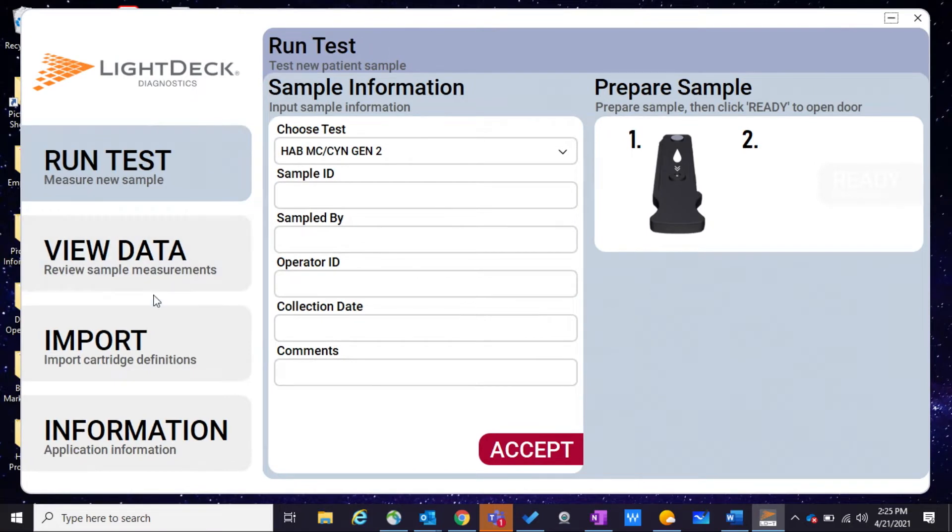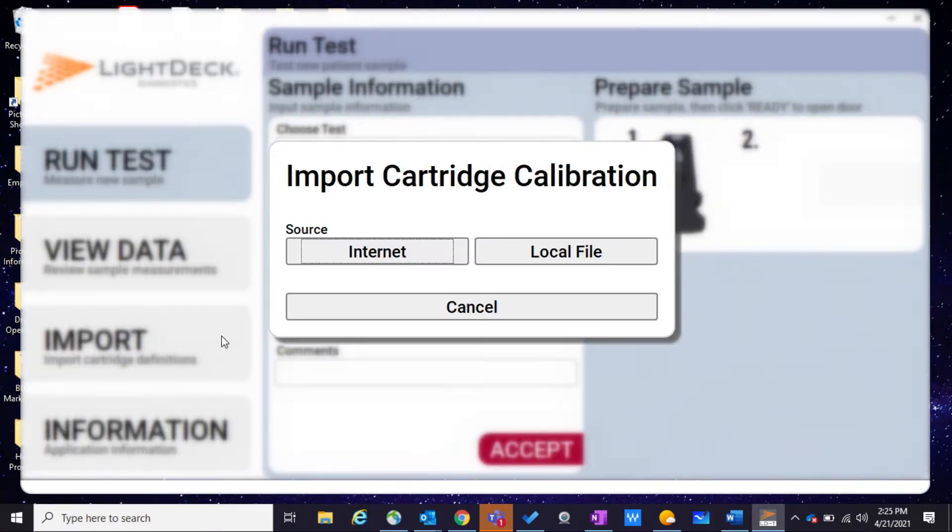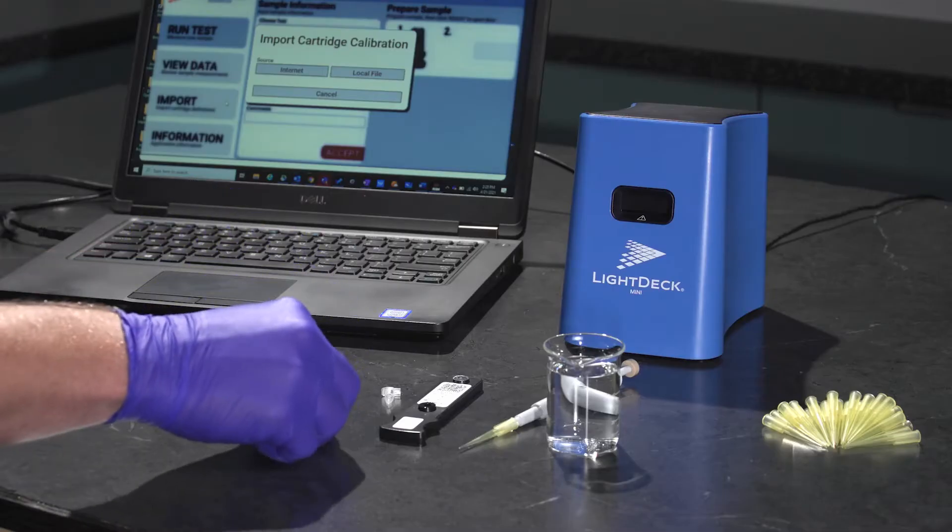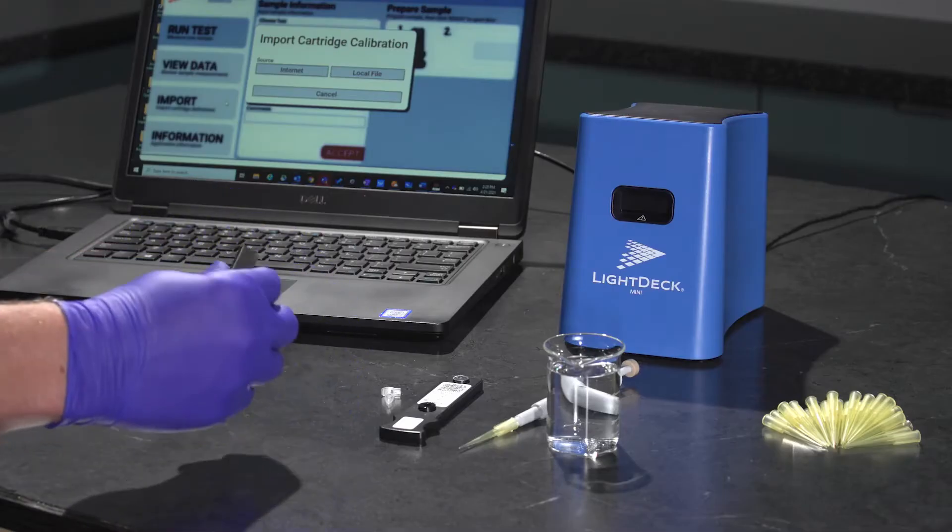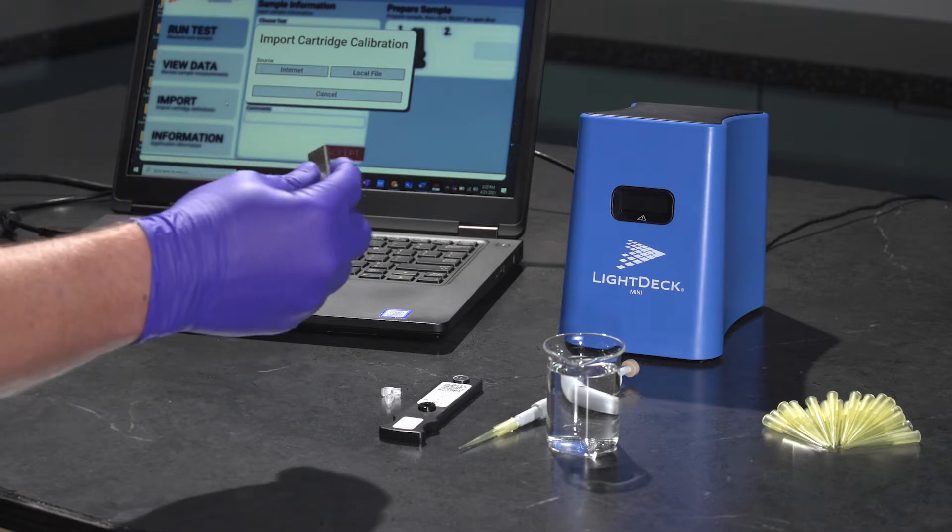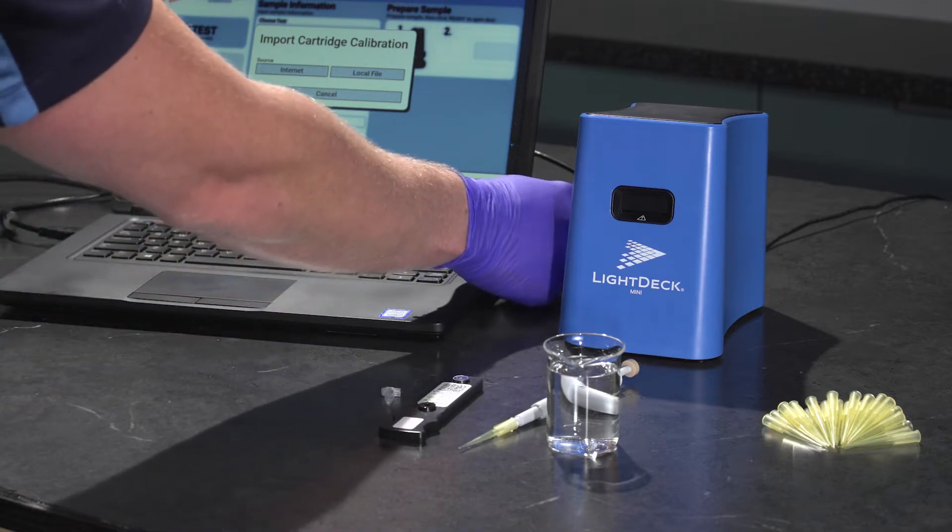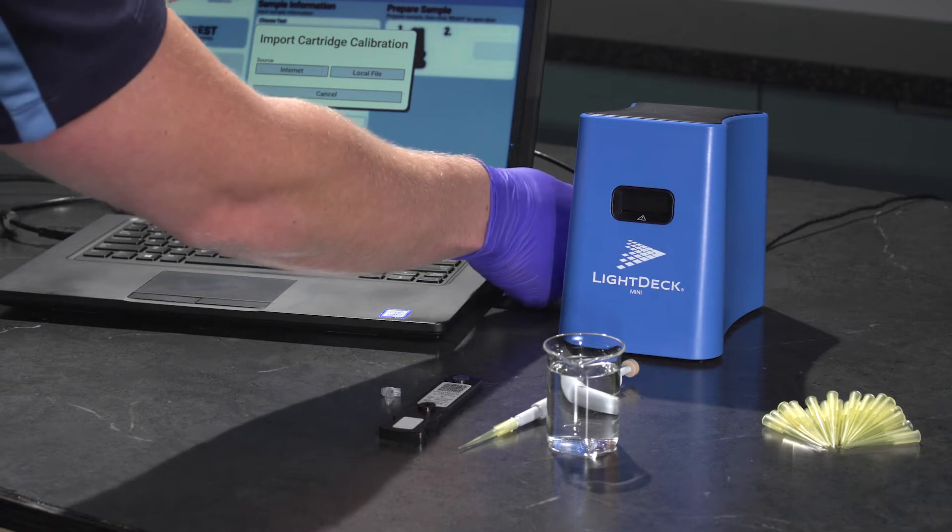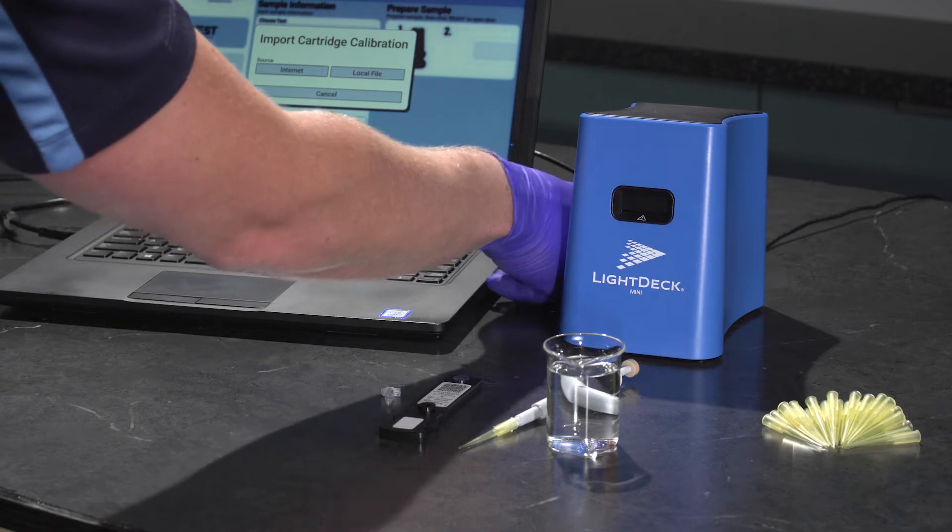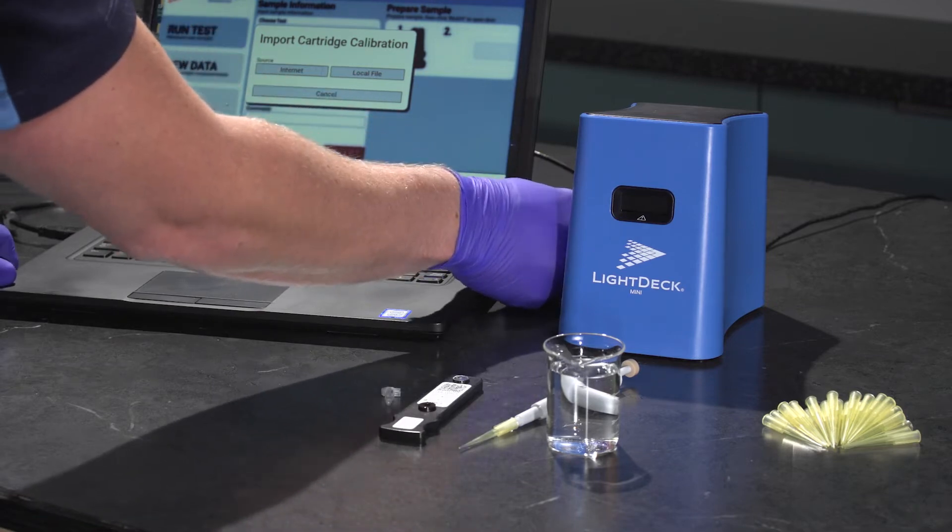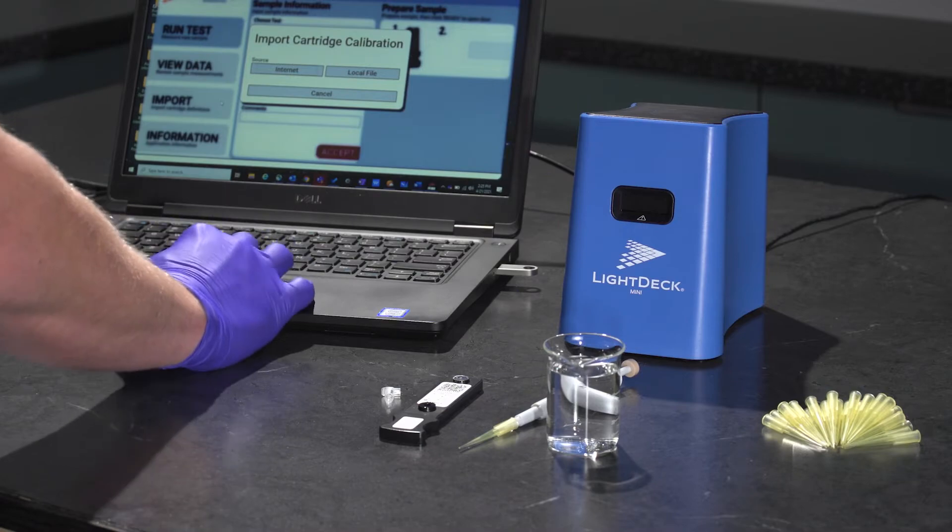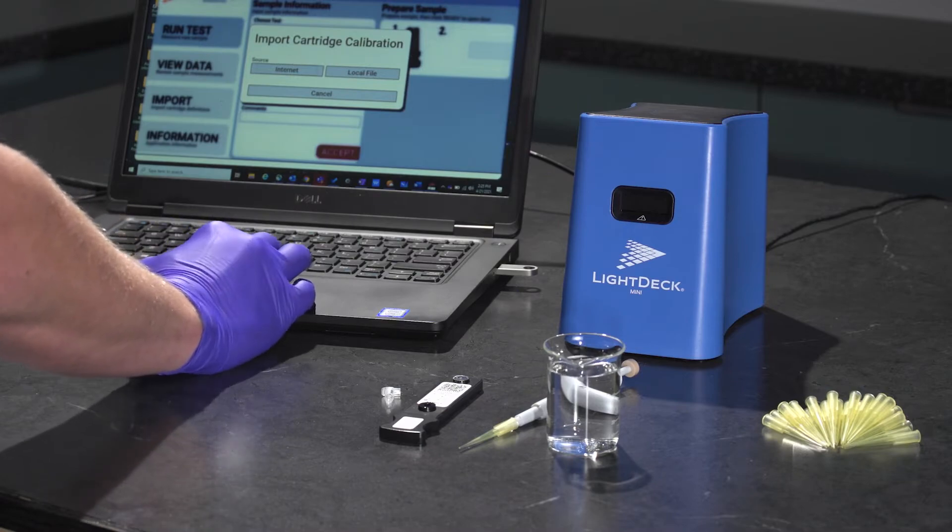Click Import, and then take the USB drive that was included with the test cartridges and put that into a USB port. Click the local file option.